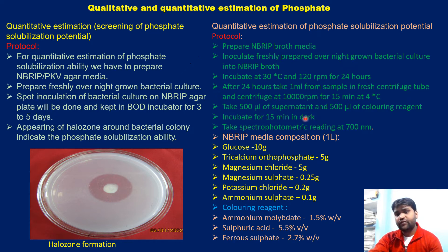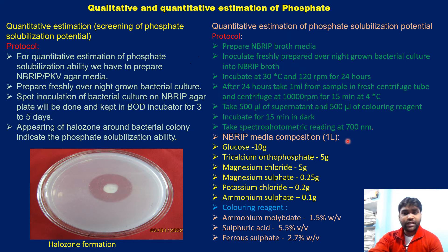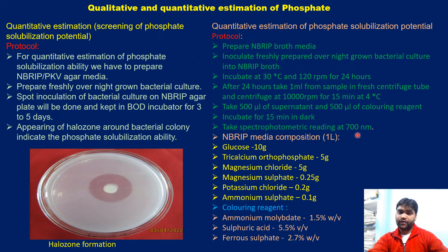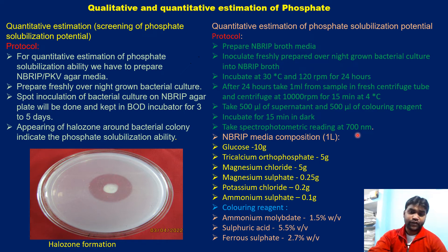The 500 microliters of coloring reagent and 500 microliters of supernatant from the culture are mixed in a single fresh Eppendorf centrifuge tube and incubated for 15 minutes in the dark. After 15 minutes, the spectrophotometric reading — OD — is taken at 700 nanometers. This gives absorbance values corresponding to different phosphate concentrations.